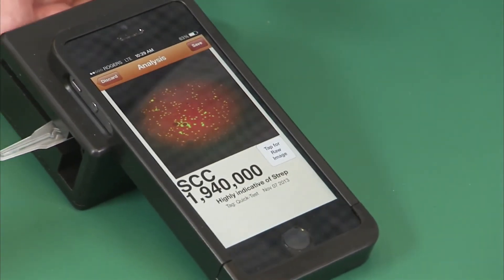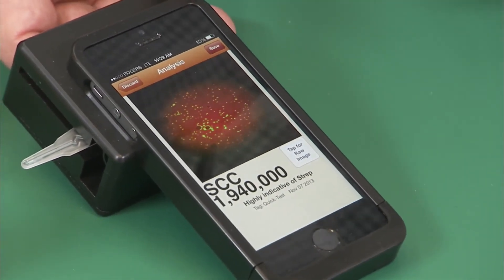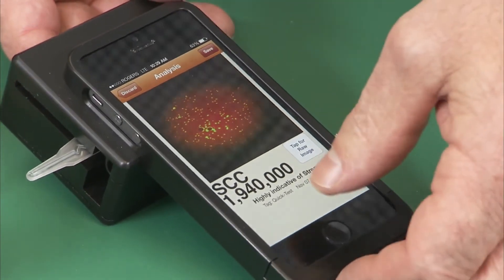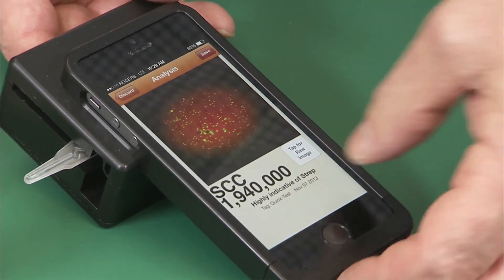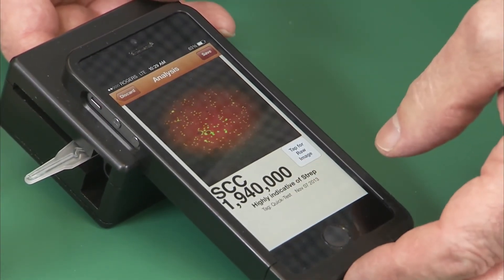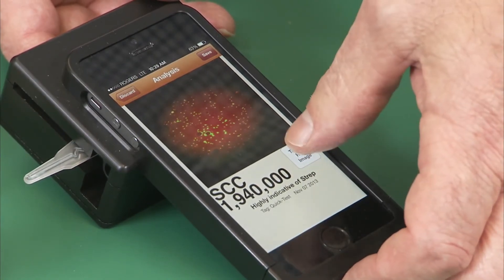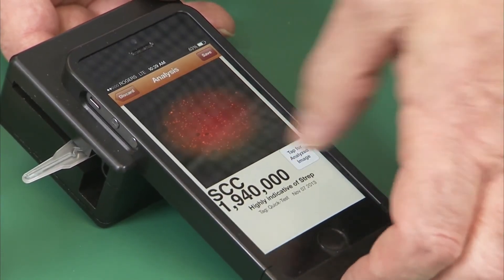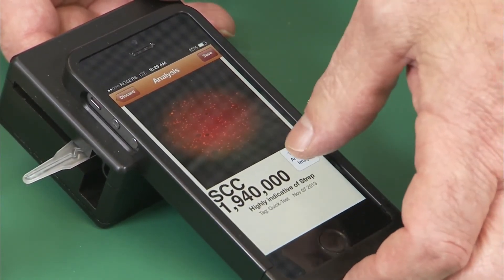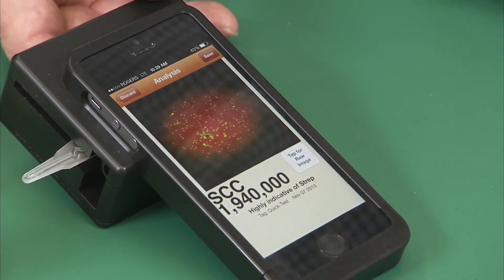As you can see, this is a fairly high sample — 1.94 million. It's also indicating the presence of strep. One other feature is we can tap here for the raw image of the milk and then select back the app image.